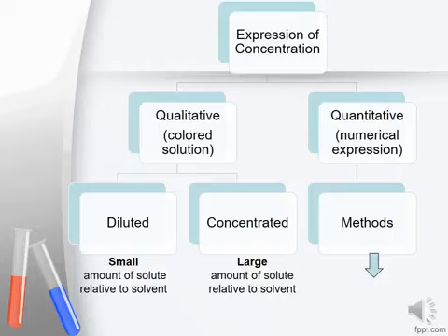Diluted and concentrated are the expressions for qualitative. What about the color of the solution? The diluted solution has a light or pale color, but the concentrated solution has a darker color.